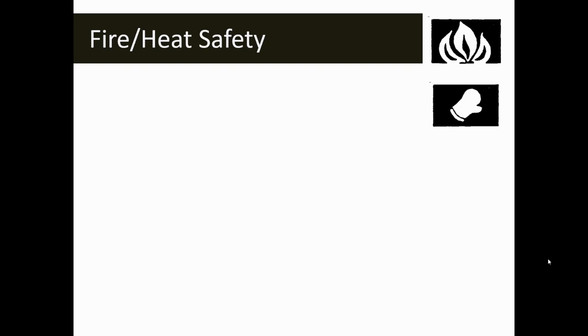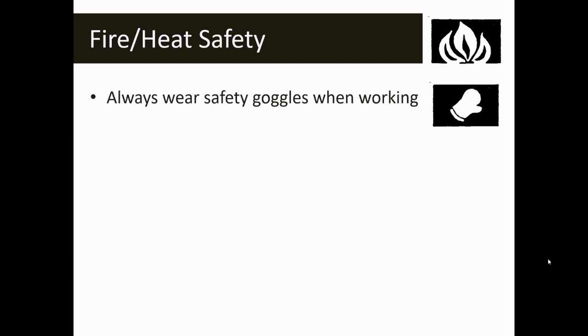The bottom symbol, the oven mitt, is our heat safety symbol. This does not necessarily mean that we're going to have an open flame, but it does mean that something is going to heat up or be hot in the lab. With both of these symbols, you're also going to see the safety goggle symbol reminding you that you need to wear safety goggles. Anytime you're working with heat or fire, you're going to want to wear safety goggles.